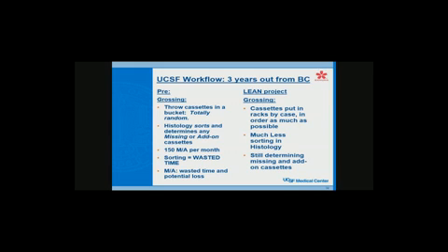Then it came to histology, and we would sort them out and determine if there was any missing or add-on cassette. By missing, I mean that they entered it in CoPath, but we didn't get it. And add-on was that we got cassettes, but they never entered them in CoPath. Because they could print cassettes on the standalone printer, they could do whatever they wanted and ignore CoPath. This was very common, or if they were rushed at the end of the day, they would get all these what we call mistakes, and they would call efficiency.